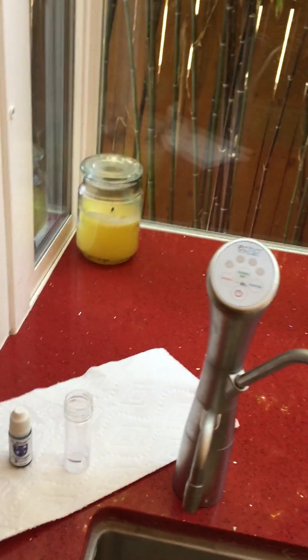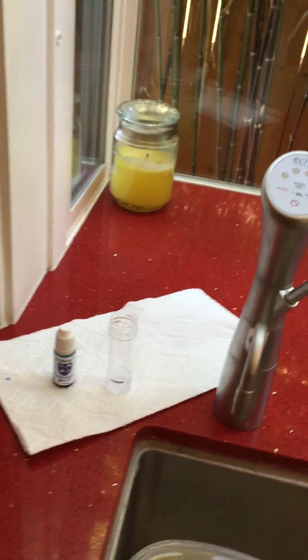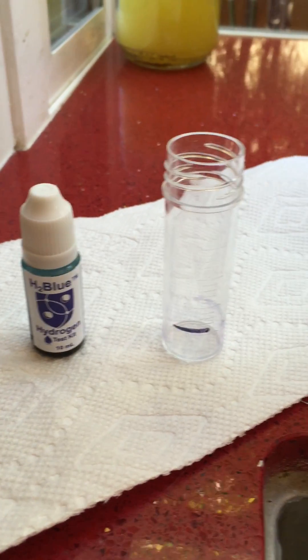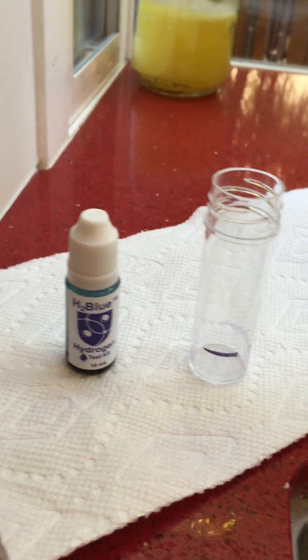Hi everyone, this is Alisa Kolker and today I'm just gonna give you a quick little lesson on how to use your H2 blue hydrogen tester kit. In case you have it and you haven't used it yet, or maybe you're a little confused, or maybe you just don't want to read the directions, I'm gonna give you a quick lesson.